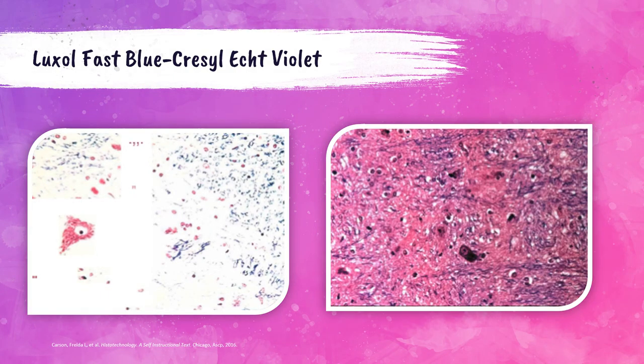A photo shows tissue stained with the Luxol Fast Blue Cresyl Echt Violet method — Nissl substance and nuclei are violet and myelin is blue. If properly differentiated, the neuron cell body will be colorless before counterstain, allowing Nissl substance to appear rose-violet. A second photo demonstrates what happens when the Cresyl Violet solution is not acidified with acetic acid: the background stains diffusely and cell nuclei and Nissl substance are not visible.